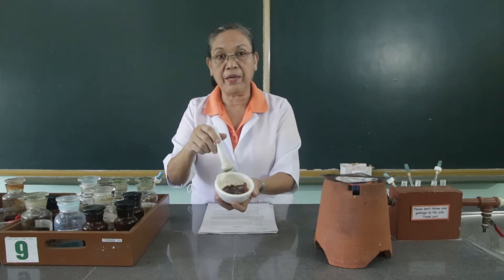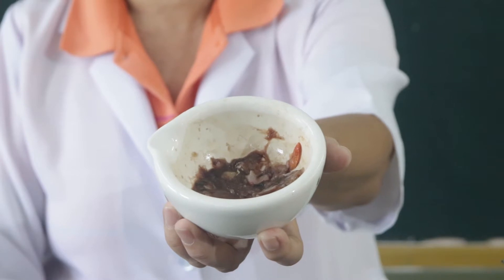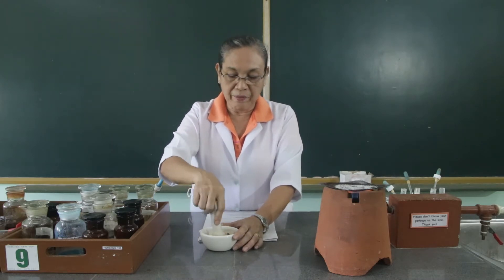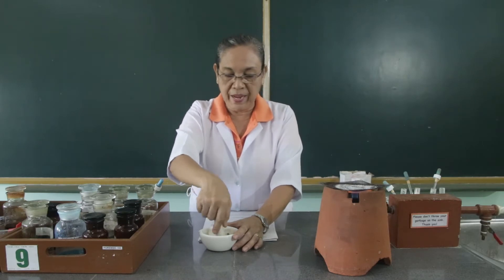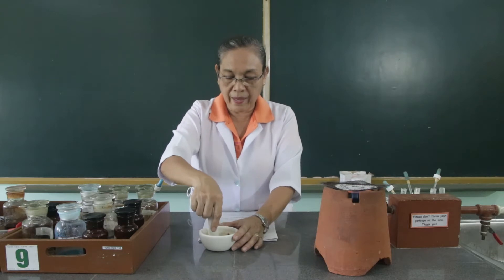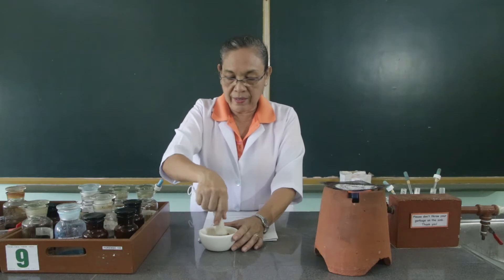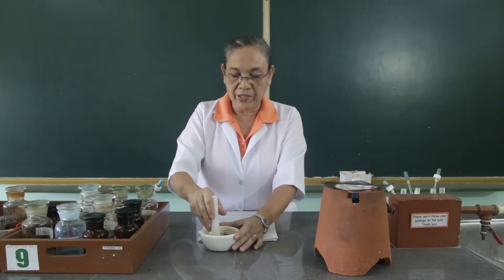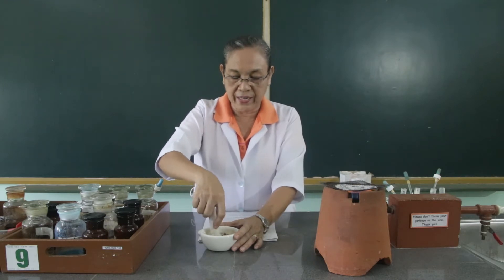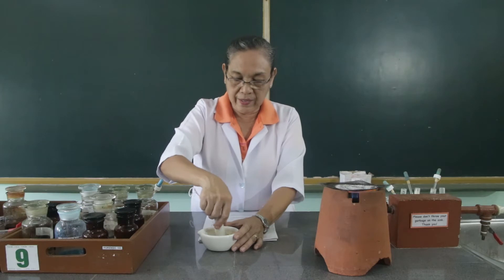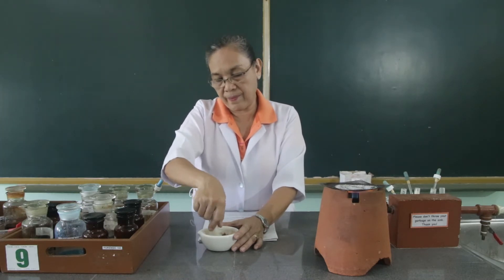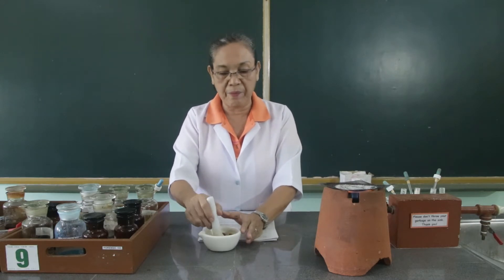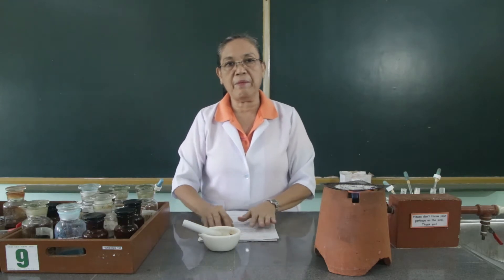So I have here the meat of the shellfish. We are going to mince or grind this shellfish meat such that it becomes fine. I am adding a little amount of sand into this meat of the shellfish to help me grind it fine. Then we are going to transfer this ground meat of the shellfish into the evaporating dish and we are going to add it with 40 ml of water.